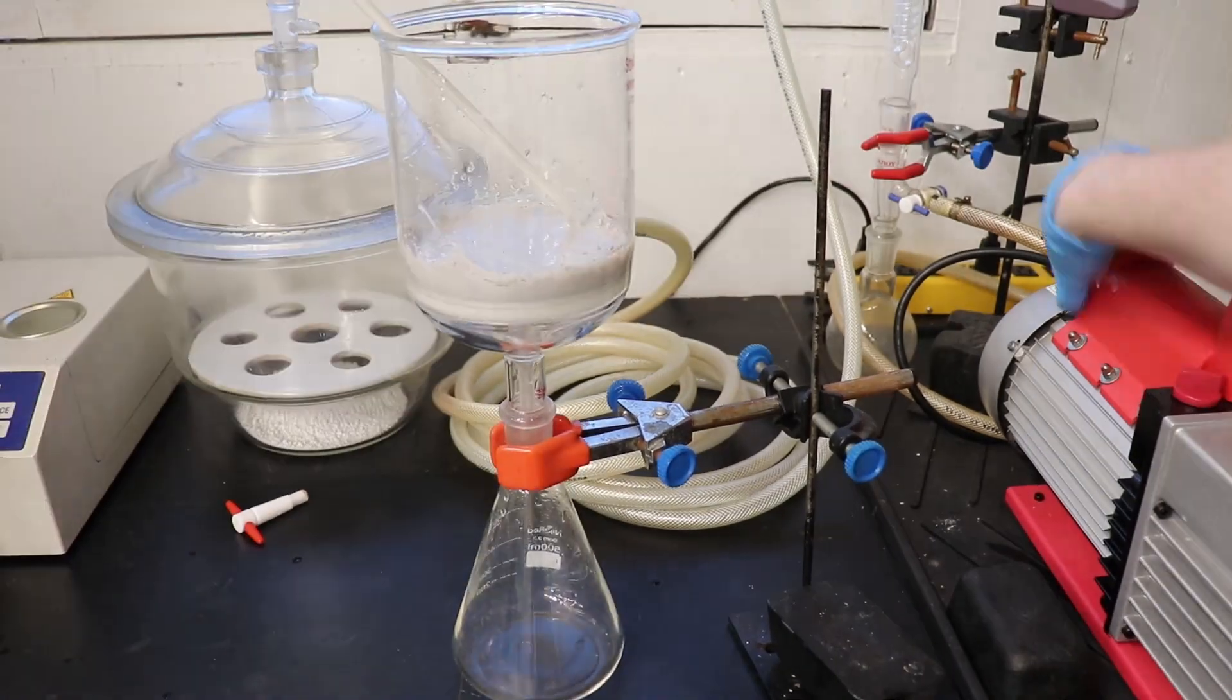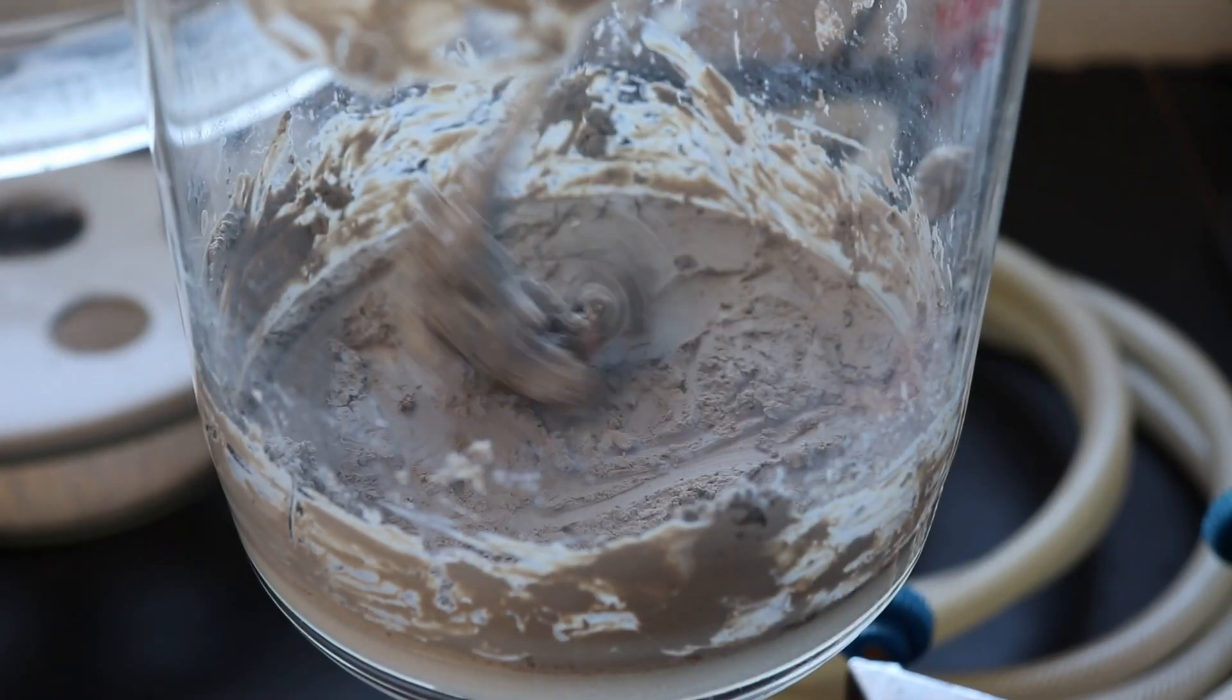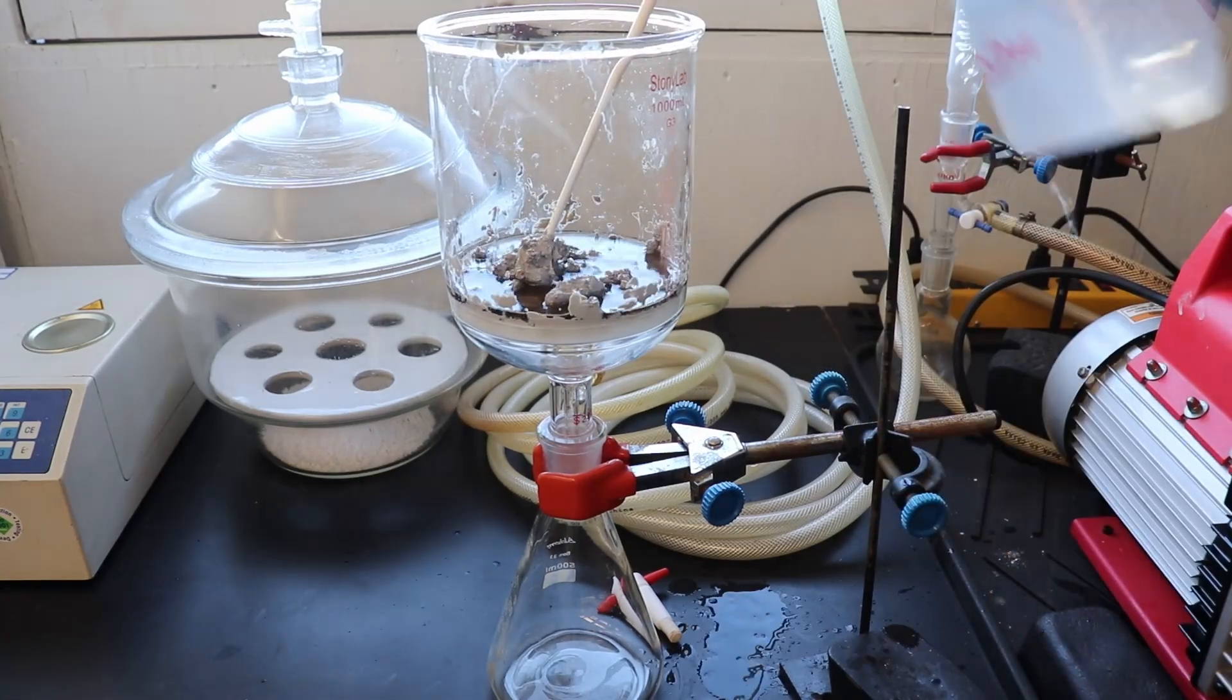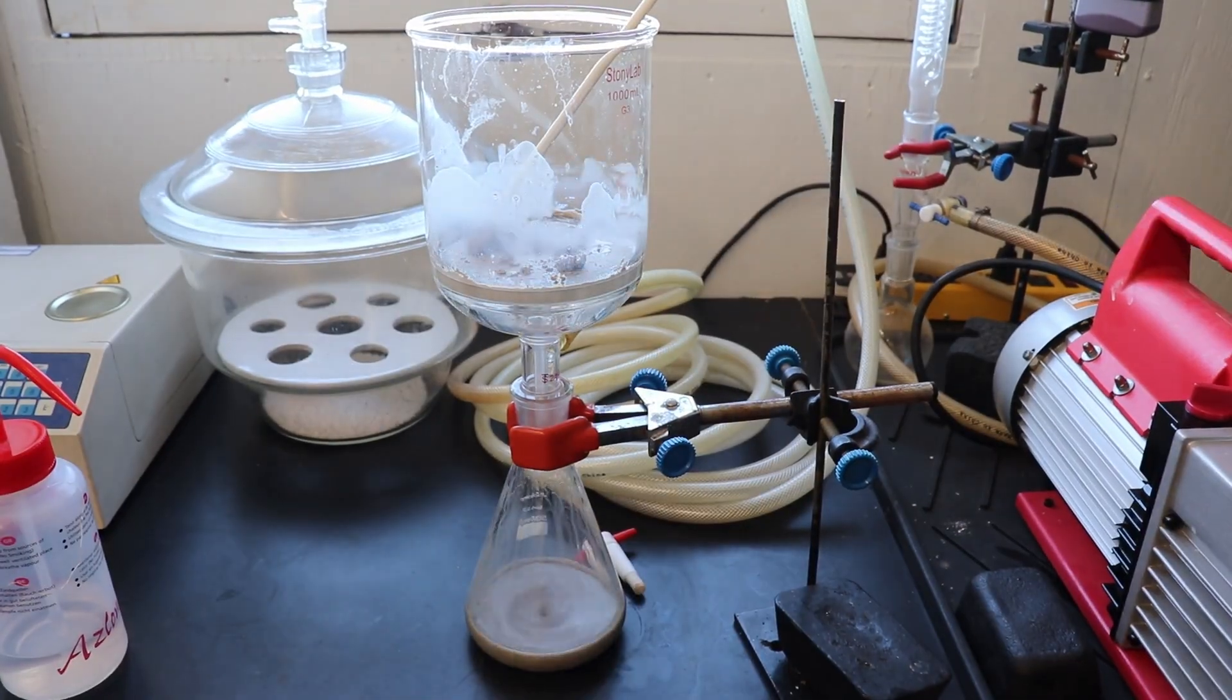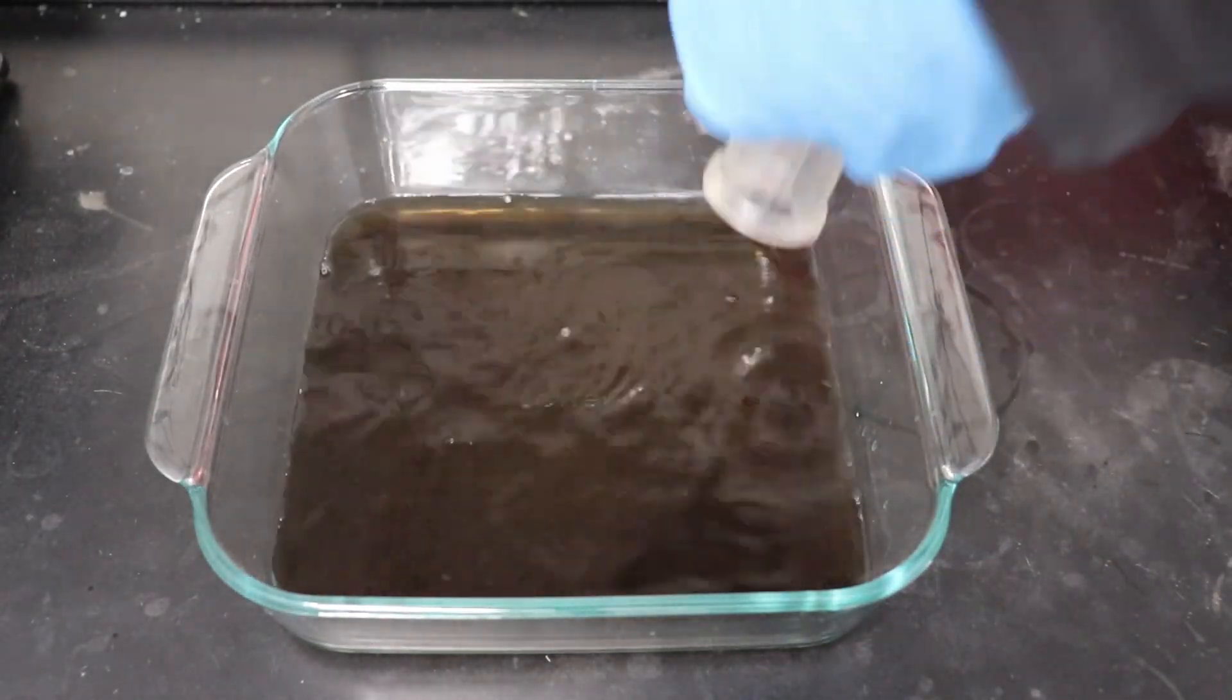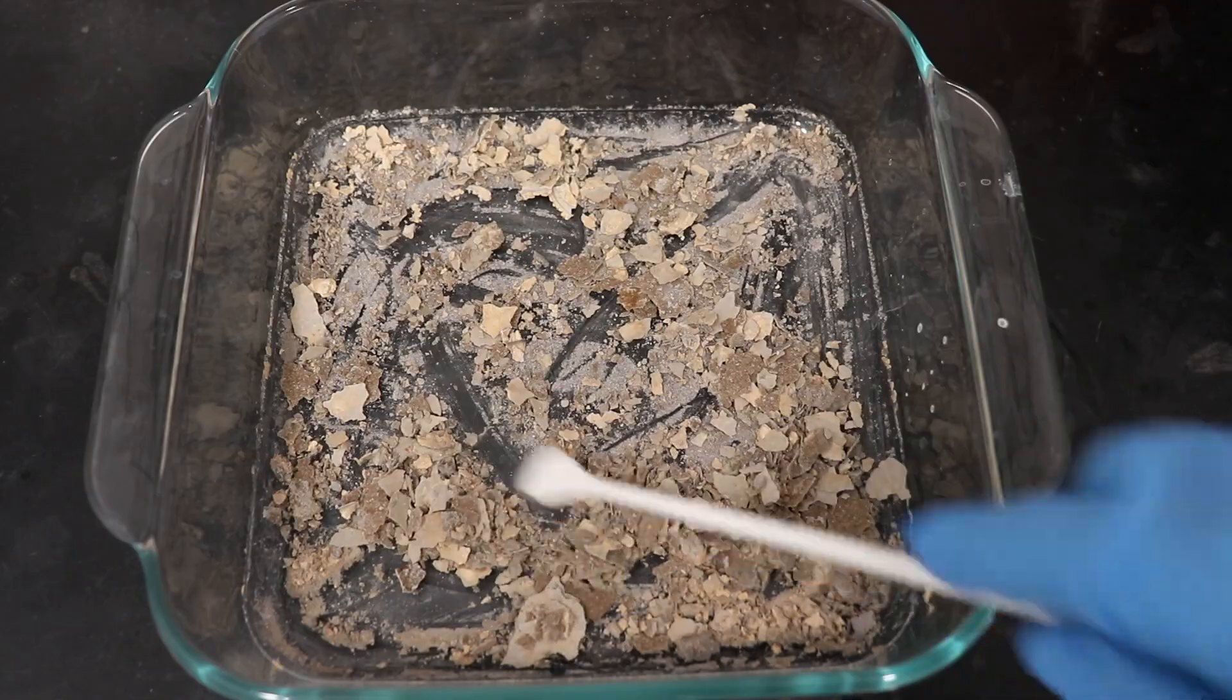I ended up with this horribly sticky gray mass of material that I had to dissolve out of the filter using acetone. The acetone solution of our crude product was poured into a dish and allowed to evaporate off. This left me with 7.9 grams of a very dirty looking material, so I needed further purification.